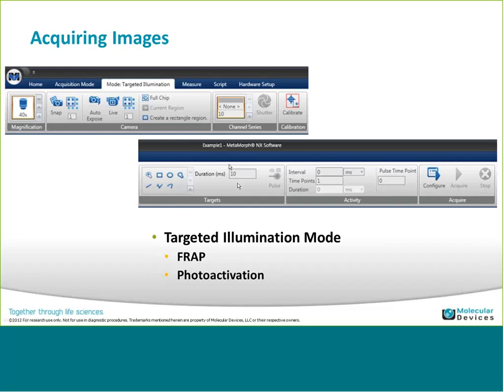Camera area, so I can choose if I want to use a smaller area. I use the create rectangular region, do my spot, and then use the current region option, and now I'm only imaging that portion of the chip, or I can go back to full chip. That's there. The save options: save as individuals versus save into groups. The save as individuals will create a new data set. And so when I've created this and hit save, it's going to add a new data set.